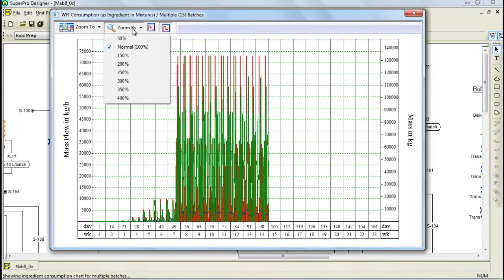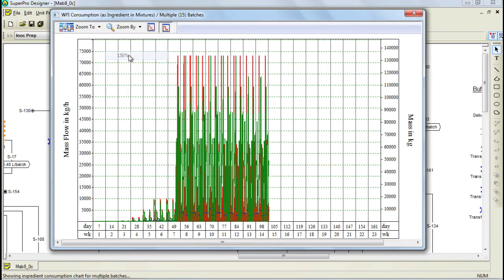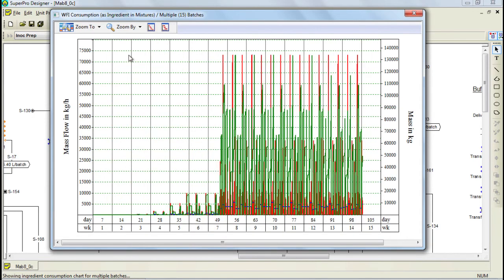If we zoom in, we can see the chart in greater detail. Here you can see that we have three lines. SuperPro Designer displays three types of demand. The instantaneous demand, which is displayed in red. The cumulative demand for a time interval, which is displayed in green. And also the average rate demand for the same time interval, which is displayed in blue.